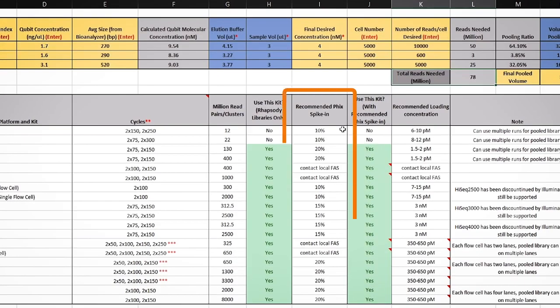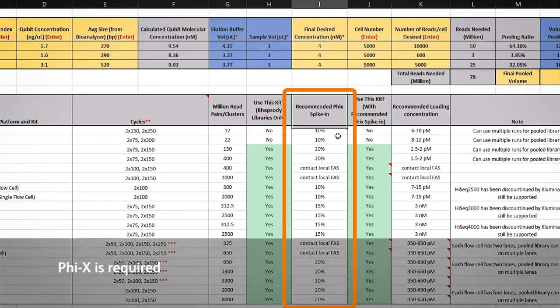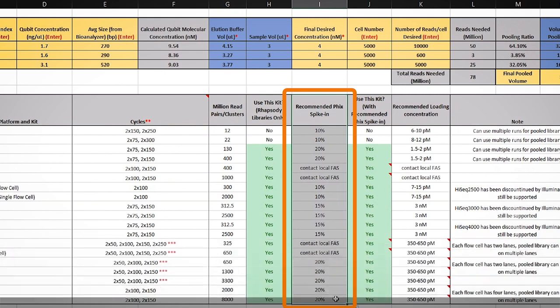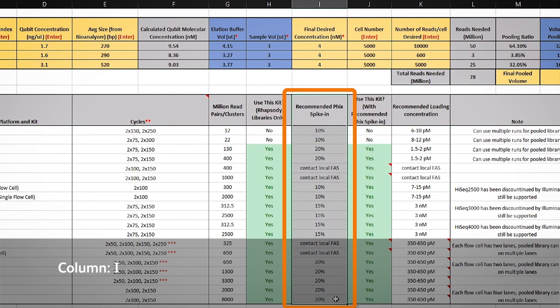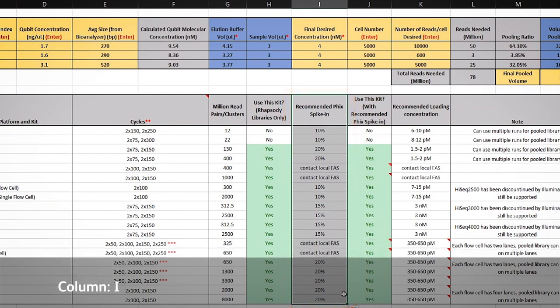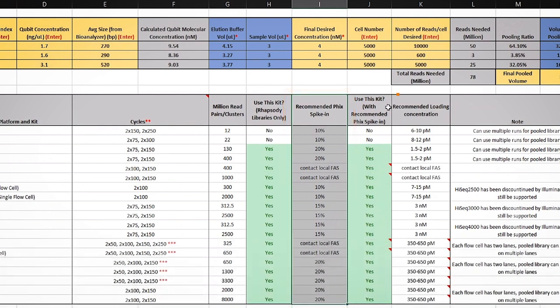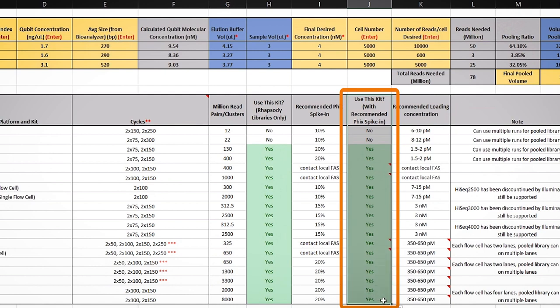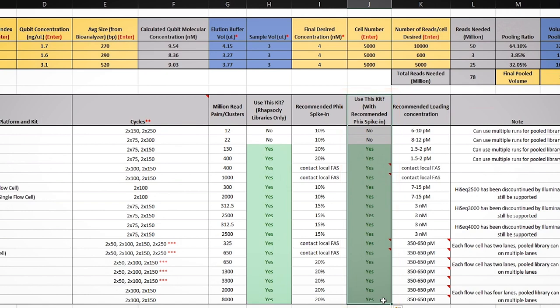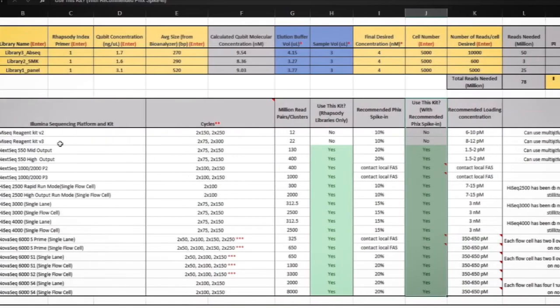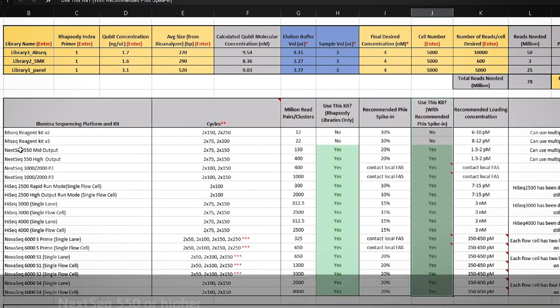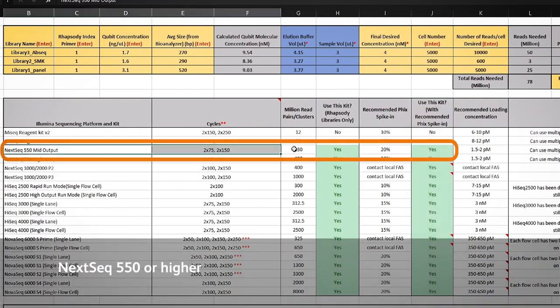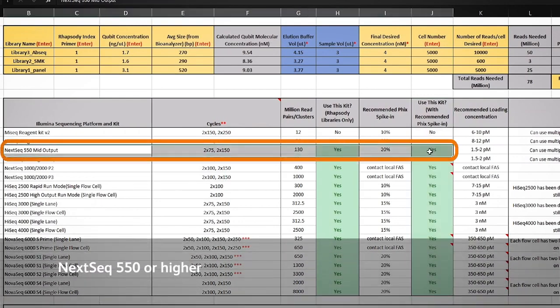5x is required when running our libraries on most Illumina sequencers, and the sequencing calculator will have the recommendations for this as well in column I. Taking everything into account, a yes or no will be displayed next to the type of sequencer that can generate enough data for your experiment. So, in this example, we can use the NextSeq 550 or higher.